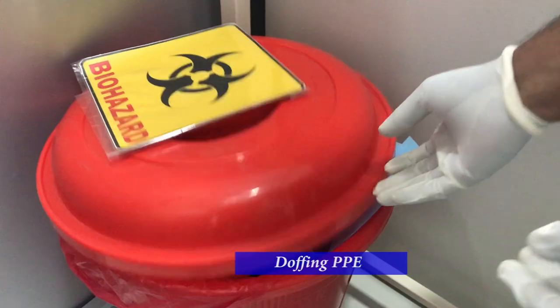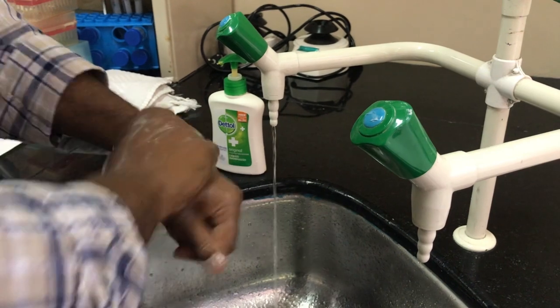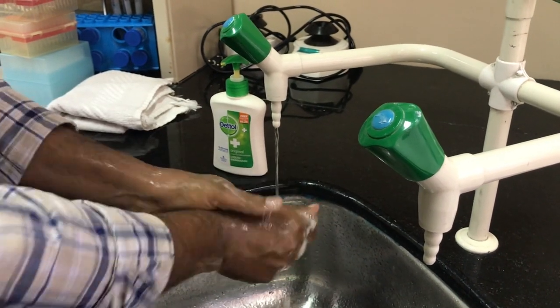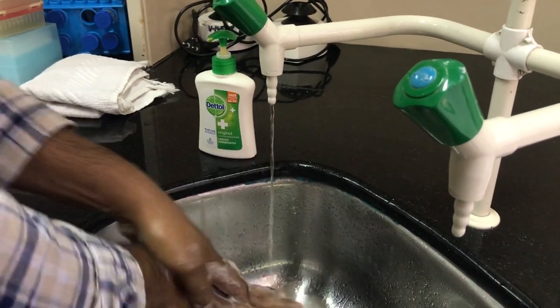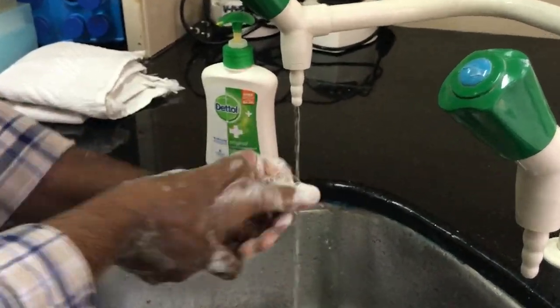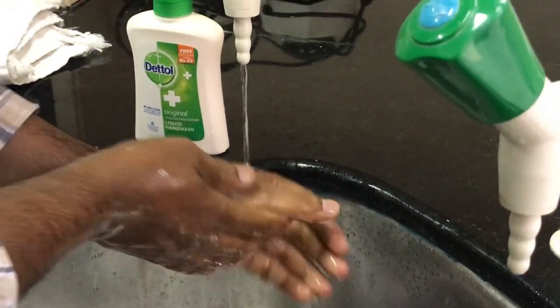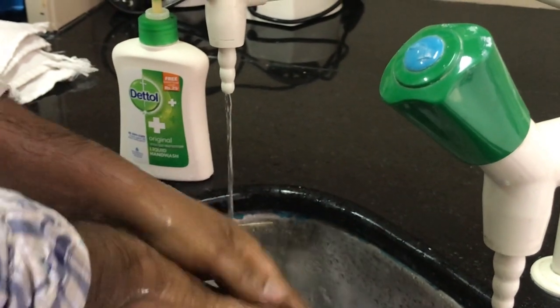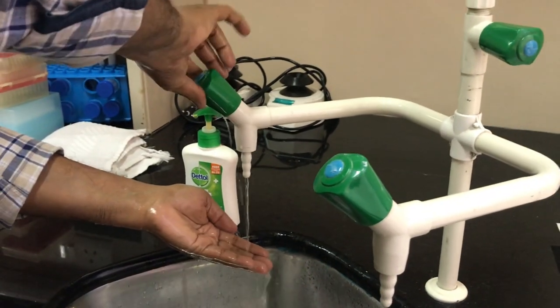Before leaving the lab, wash your hands with soap and water as per the steps of WHO. Now we move to the next part, that is part 2.